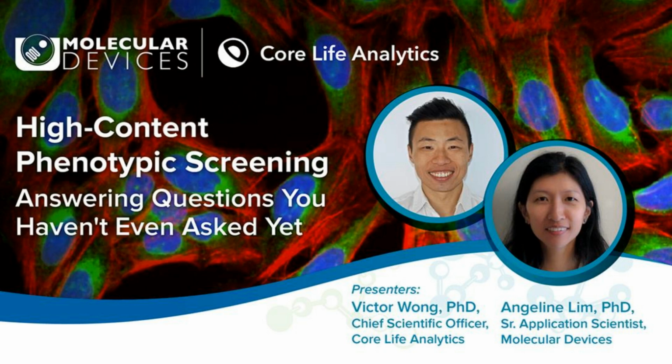Let's see. From beginning to end, an average experiment. If we're going to start with the bench work, that would take a few days just to get an experiment set up. And once you acquire the images, and if you're familiar with your workflow already, you can get it done within a day. I would say, maybe Renan or Victor would have something to add over here.